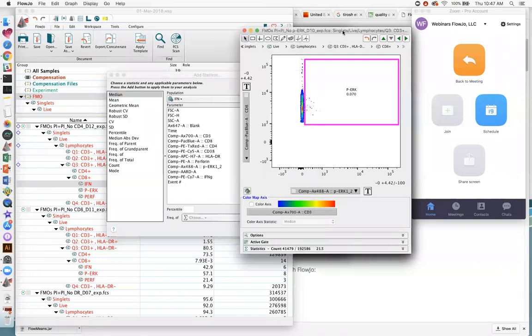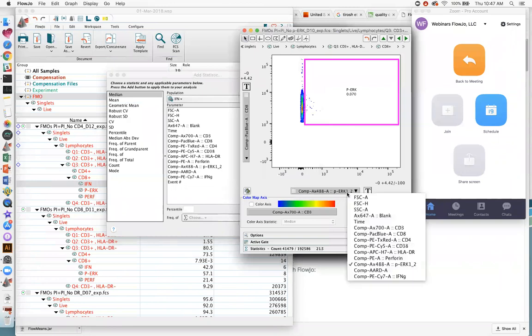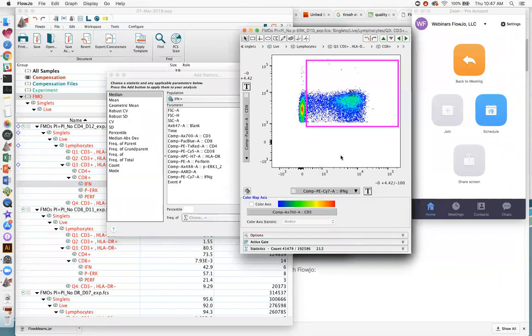A lot of times in flow cytometry, we're looking at data that are plotted along a logarithmic scale, right? It may be bi-exponential, but here, in this case, from 10 to the 3rd to 10 to the 5th, we're on a logarithmic scale. So a single outlier on the far side, if you had chosen the mean statistic, would skew the mean very, very strongly towards the right. Same thing if you have a single event on the negative side, the mean would be skewed very strongly towards the left.